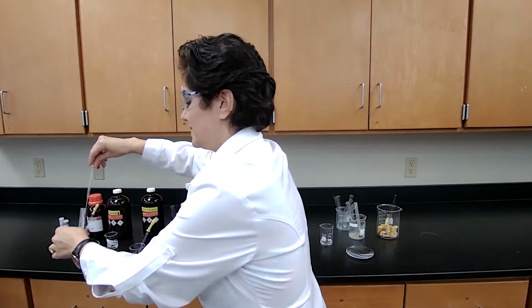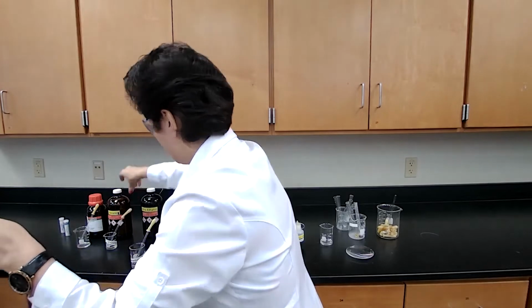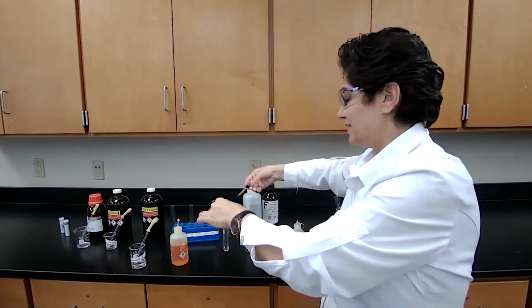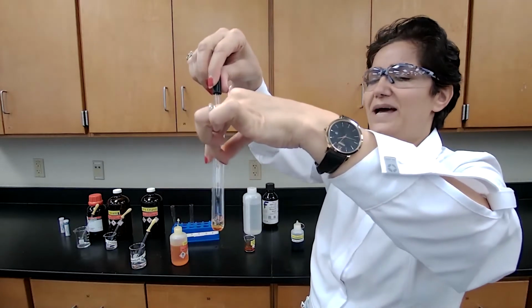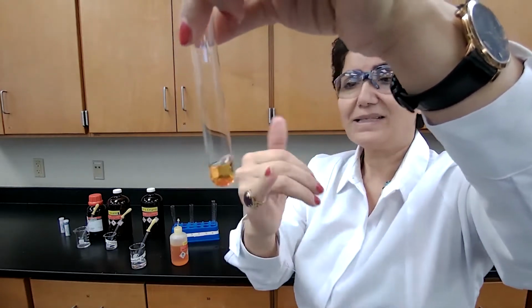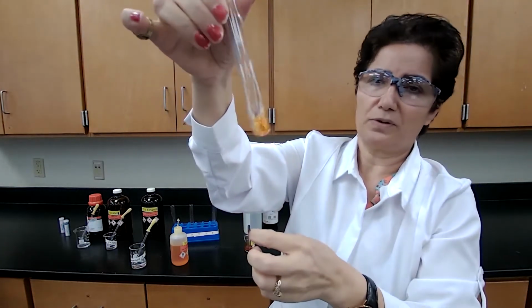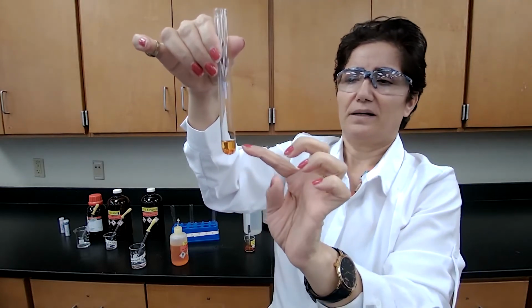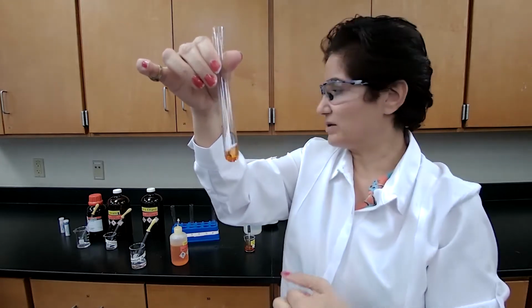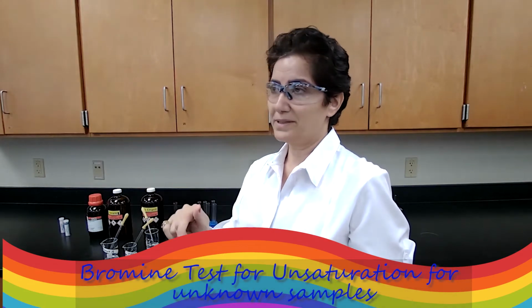Hexane is a saturated hydrocarbon, so the bromine water test is expected to be negative. I'm going to add the bromine water to it. That orange color stays. It did not disappear. It just got diluted because, of course, I am adding one drop to this volume. So it is a negative test for bromine water. It did not disappear.